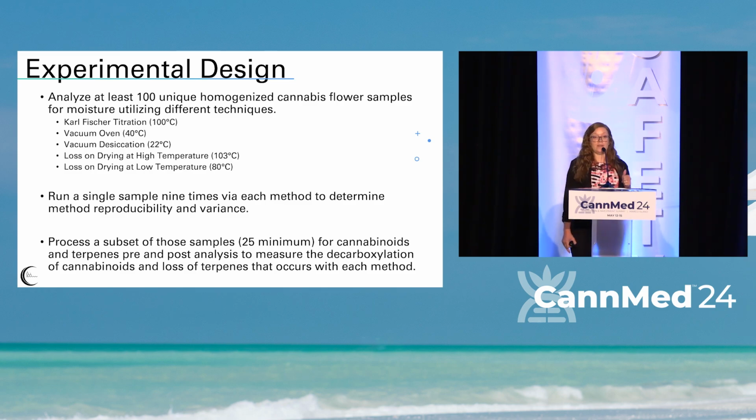One of the complaints we've heard in the industry is that some of these methods, you run them and your results change drastically from run to run across the same sample. So we wanted to see, are there any concerns for that?